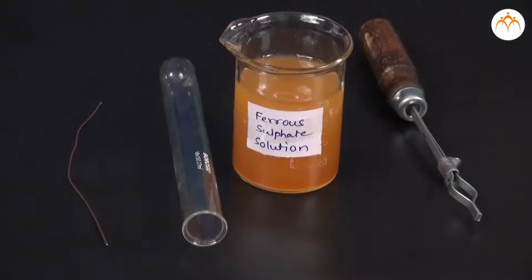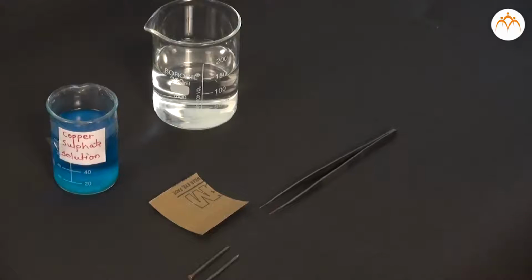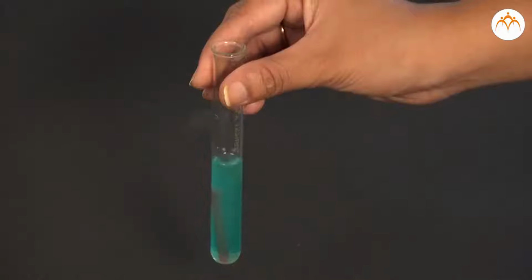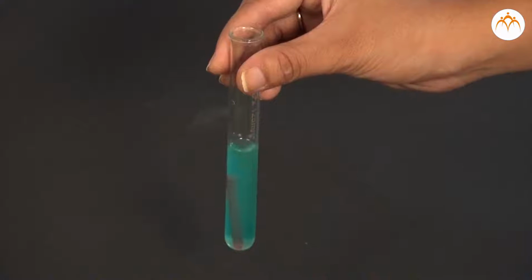Reaction of metals with other salts. Metals are not equally reactive. Take a clean copper wire and an iron nail. Put the copper wire in the iron sulfate solution test tube and the iron nail in the copper sulfate solution test tube.